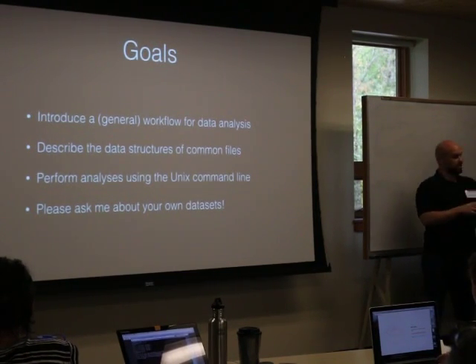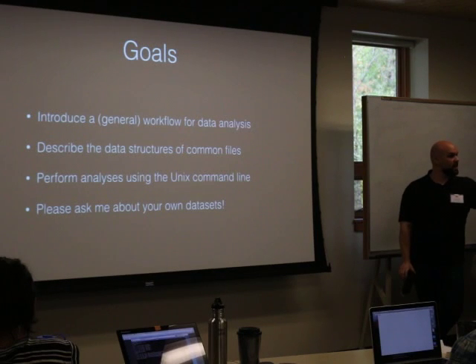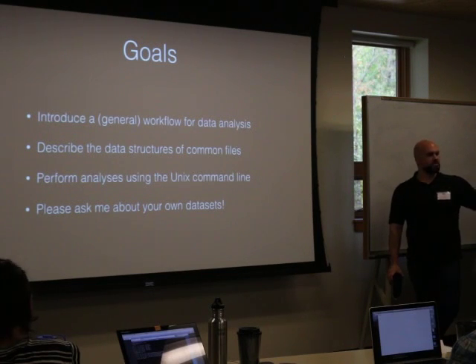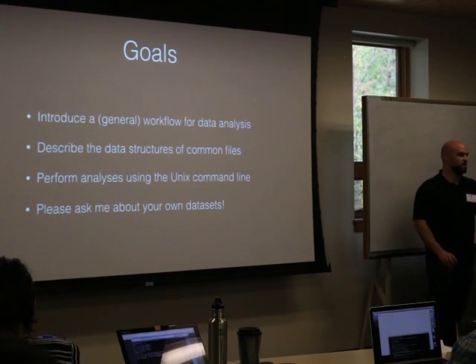But in addition, and I guess this is the fun time to mention this. So in my data folder, you've got the raw reads and a reference genome, that stuff. I also included a folder that's just called test. It actually includes the results of everything at every step. So if somebody has any sorts of problems, maybe something's not working, I'm of course able to help try to troubleshoot things, but you can still look at the files, you can still see what the output would be, and then we could have a discussion about trying to get things pieced apart.